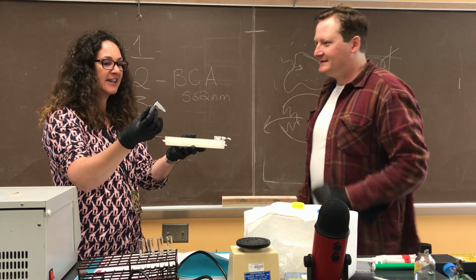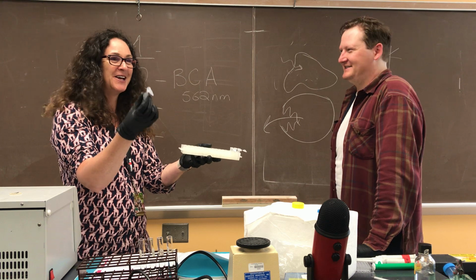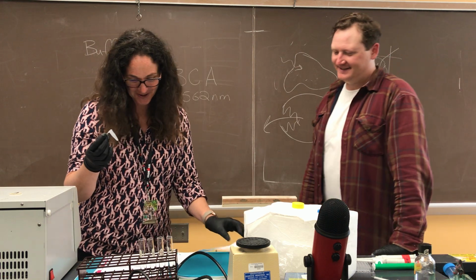And they're called anything in your protocols from flip-top tubes to centrifuge tubes to microtubes. They've got all sorts of weird names. It just depends who wrote the protocol.